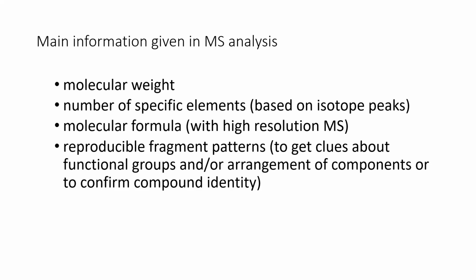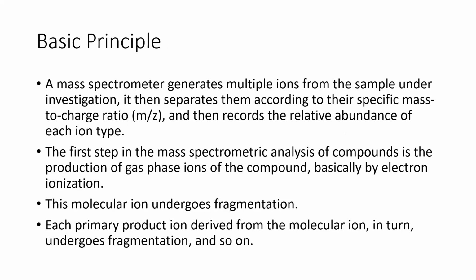Just like your infrared, you have your absorption bands for different functional groups. And when you run your infrared, you can say whether it's a ketone or an aldehyde or a carboxylic acid. The same way, the fragment patterns are also fingerprints that are useful in mass spectroscopy to know the kind of functional group or the arrangement of atoms in a particular molecule. So it's not just enough for us to know the molecular weight or the molecular formula. We also need to know the arrangement of the compounds or the molecule that generates such spectrum.